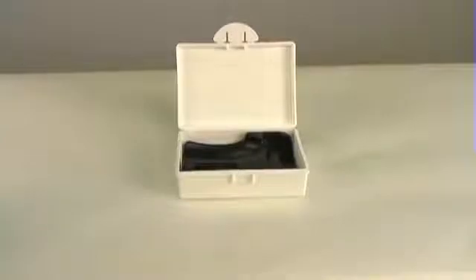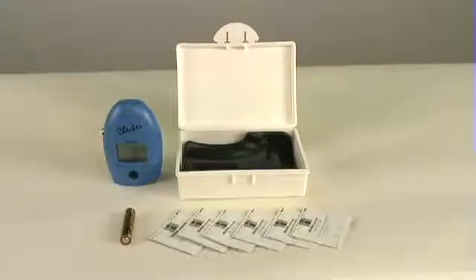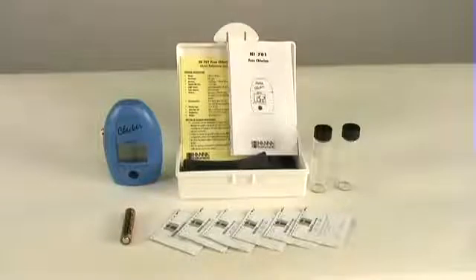What comes with the package is that you get the meter, battery, six Chlorine DPD reagents, two cuvettes, a quick reference guide, and the manual, as well as a hardcover shell.